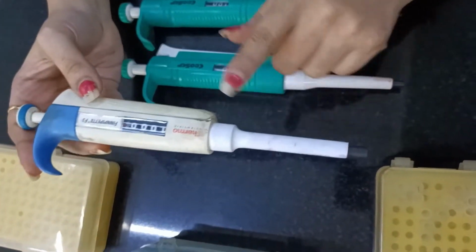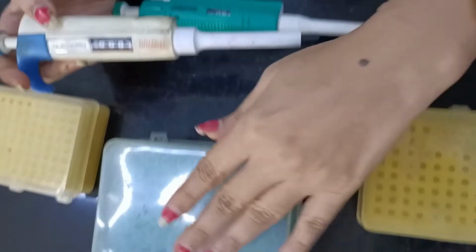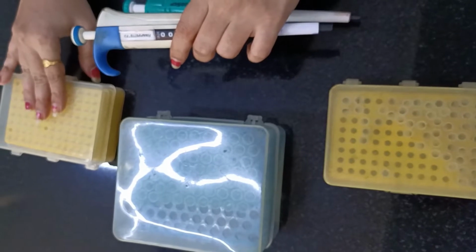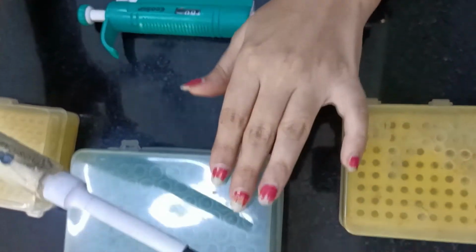Okay, so we'll see how the working of the micropipette should be carried out. Now with respect to this higher 100 to 1000 microliter, we are going to use these micro tips. According to differing microliter volume, different kinds of micro tips are available. So with respect to this higher volume, we are going to select these micro tips.